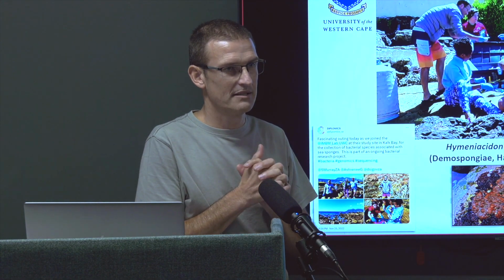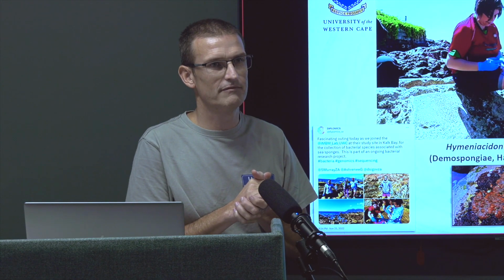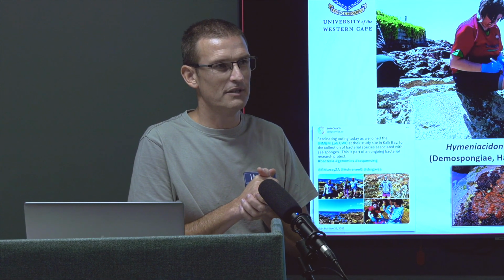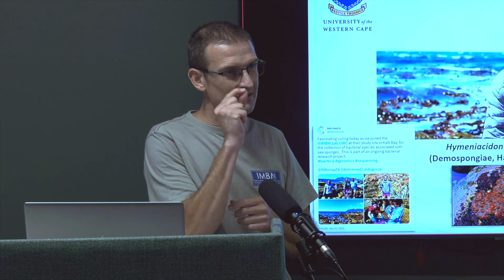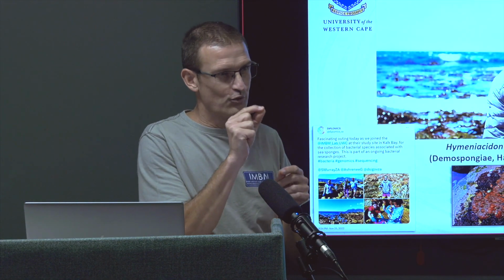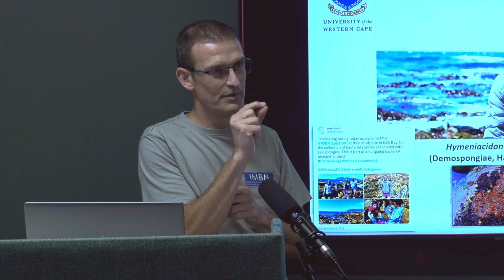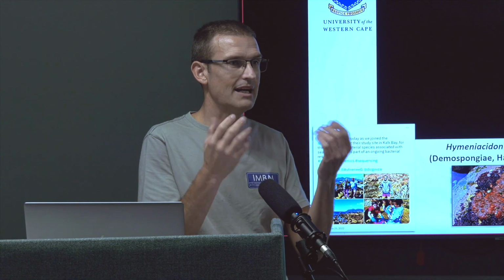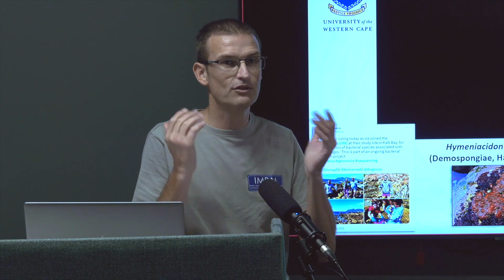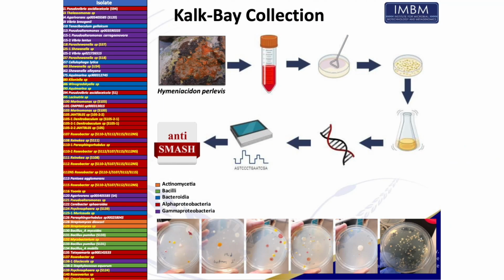The plan here was to do something called single-cell genomics. I said I'm the manager for the flow cytometry facility. If you don't know what a flow cytometer is, it is a 10 million rand machine that can single-cell sort anything in your sample. So at single-cell resolution, we can kick out and sort those individual bacteria or mammalian cells or what have you. And you can then isolate their DNA, amplify it, and sequence everything in there. So there's some amazing technology that we have access to.